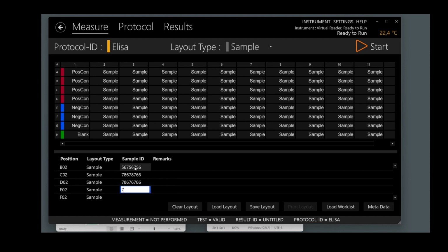If a barcode scanner is connected, it emulates the keyboard and automatically transfers the scanned barcode. As a rule, the scanner also automatically emulates the Enter key after the scanning process so that all sample IDs can be entered using only the scanner.